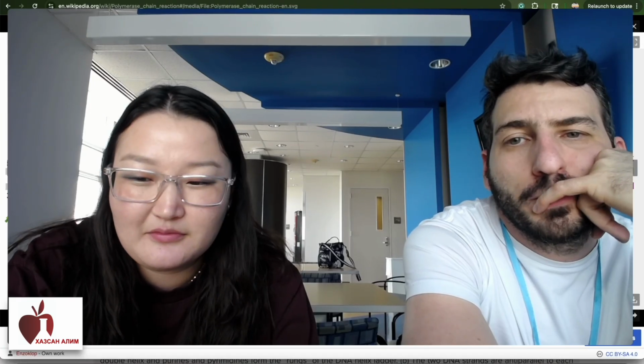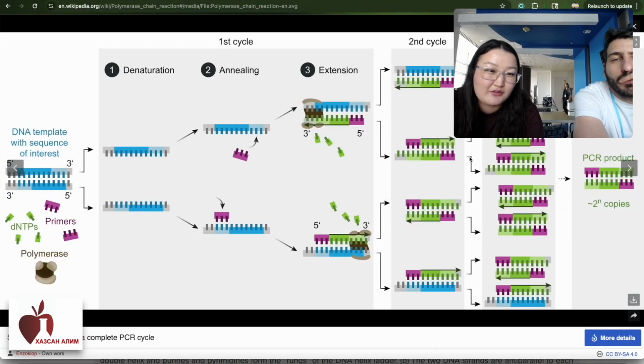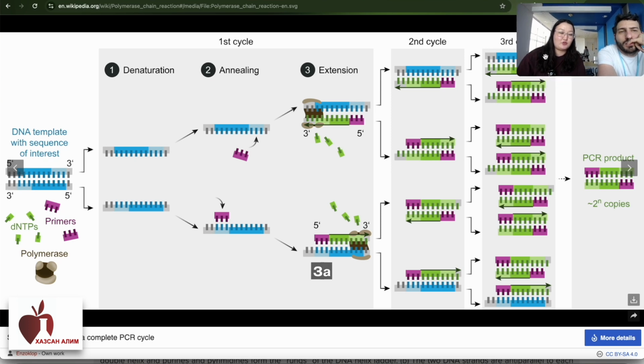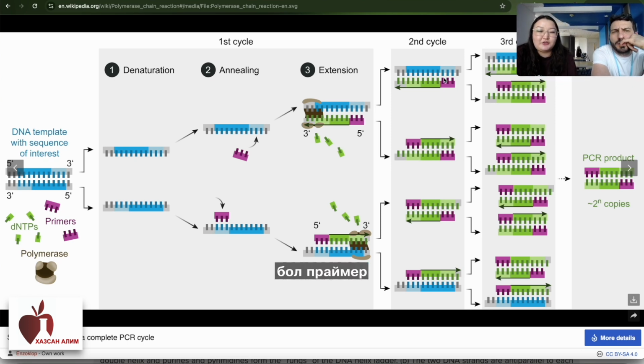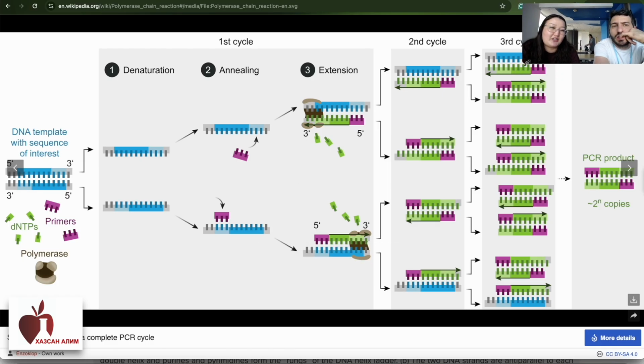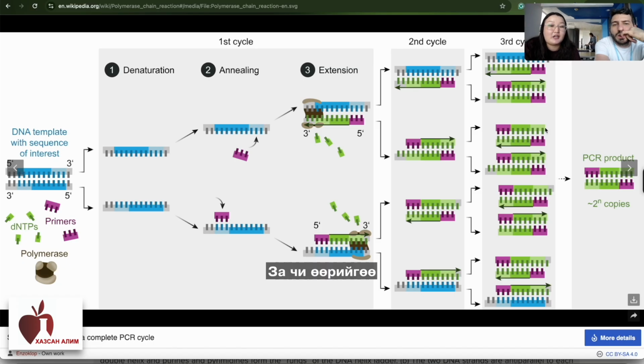Okay, let's get started. First, we need to open Chrome. Okay, he's going to explain what a primer is first. And then, if I have a question, I'll ask Fernando for you. Okay, please pretend you are the PI. I'm a master's degree student. Okay, yes.